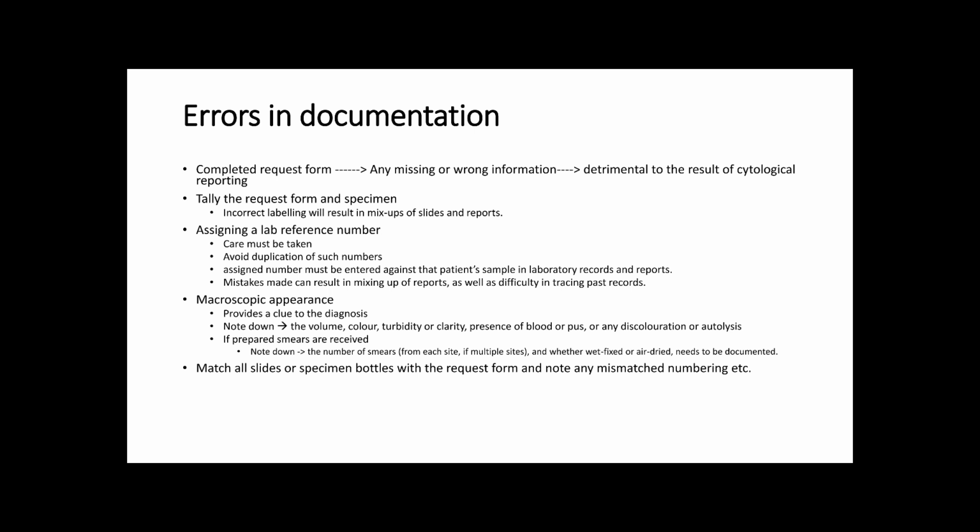Another thing, the macroscopic appearance of fluid is very important as it provides a clue to the diagnosis. It is essential that the volume, color, turbidity or clarity, the presence of blood or pus, any discoloration or autolysis due to putrefaction are recorded on the form given for reporting or by the receiving technical officer.